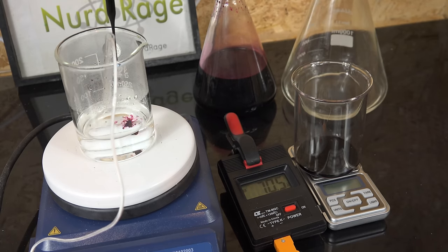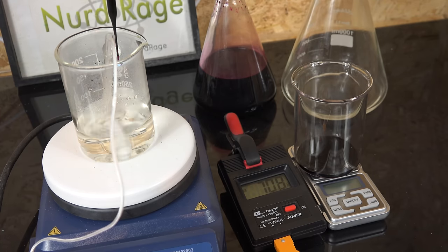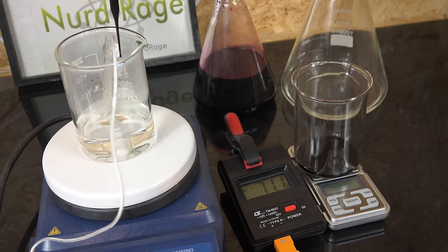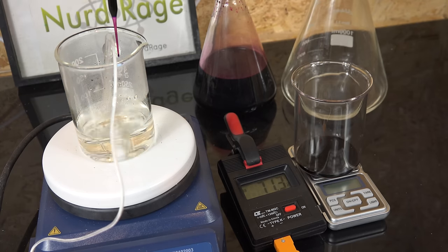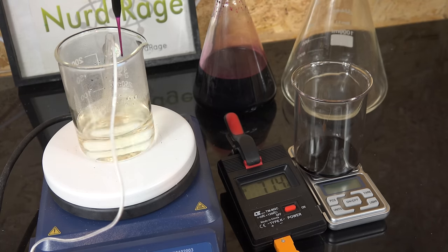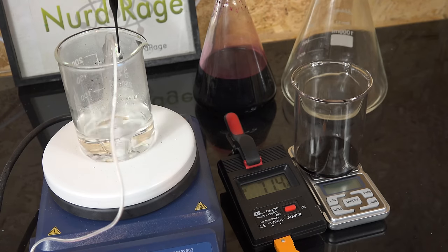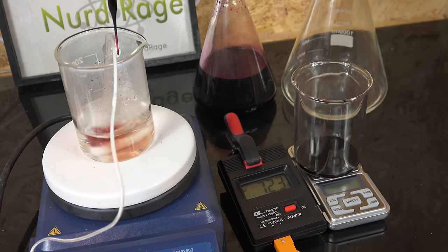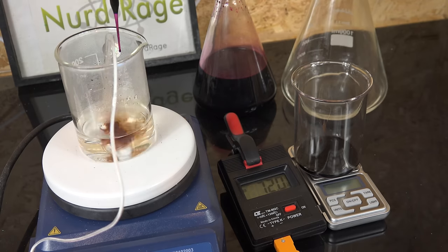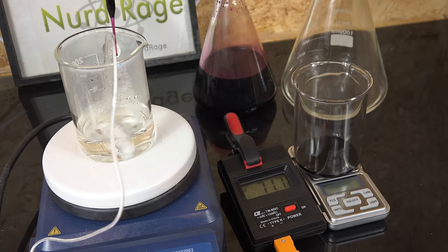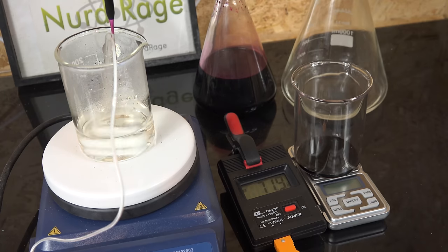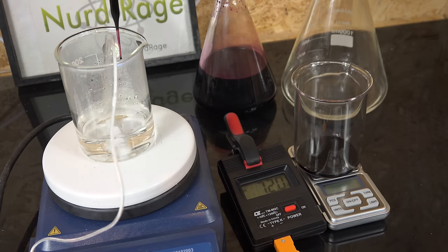If you want to verify the sodium oxalate yourself rather than trust a purchased and certified primary standard, you would use a type of titration called amperometric or coulometric titration. That's basically an electrolytic titration and lets us verify primary standards or even replace them with electrolytic reactions. Someday I'll do them but for now let's just focus on the classic methods. Now you might be asking if these primary standards are so good, why aren't we using them as the titrant directly?